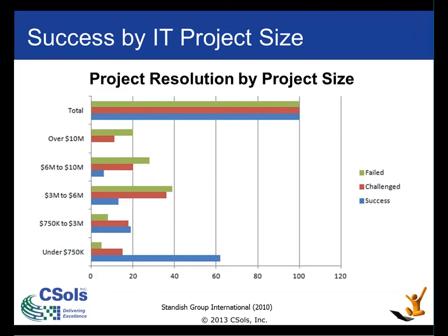For laboratory informatics, I would say it's typical that projects are in the 5 million or below category. There are not that many projects over 5 million unless they're global in nature or very, very large. So most of them are in that 0 to 5 million category. If you go at it in the normal way, you have anywhere between a 20% and 60% chance of success. This is not very good performance, but again, this is typical for all projects around the world.